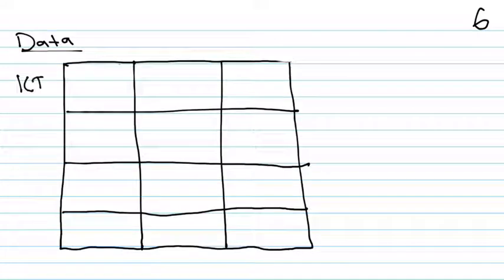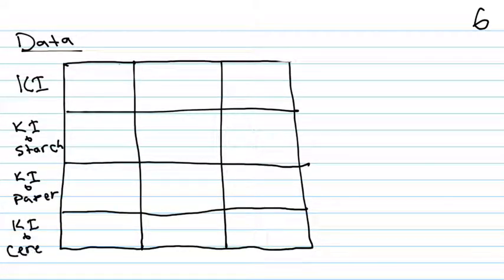Now, there's usually a data table in your lab. With your data table, you want to make sure that you get that in before the lab is done, or before the pre-lab, so that you don't have to waste time during the lab, okay?